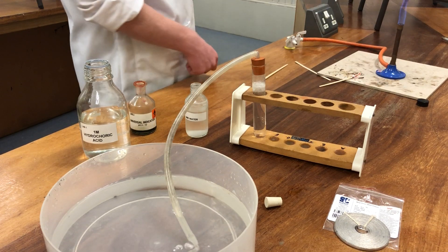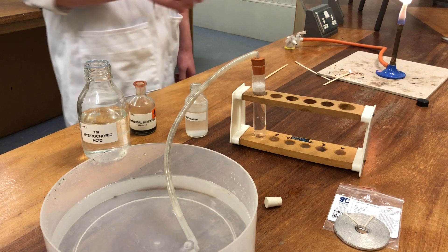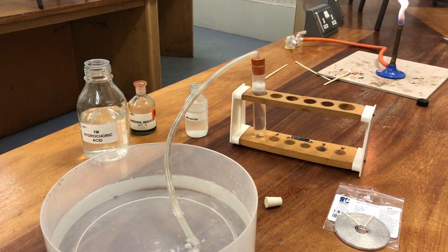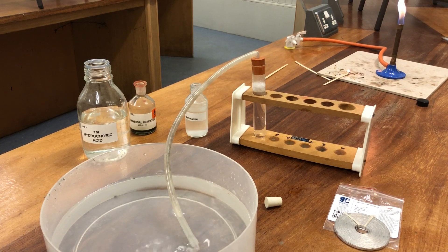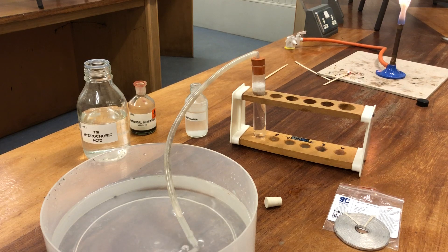To recap the gas tests: the universal indicator remained green, lime water remained clear and colourless, the glowing splint was extinguished, and the burning splint made the hydrogen gas burn with a pop.